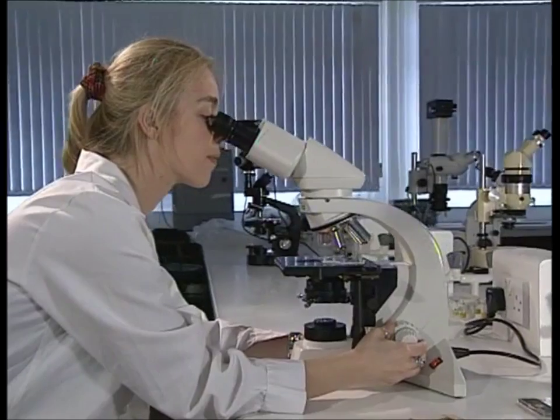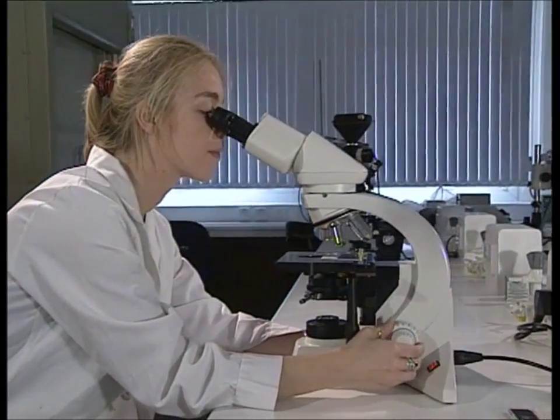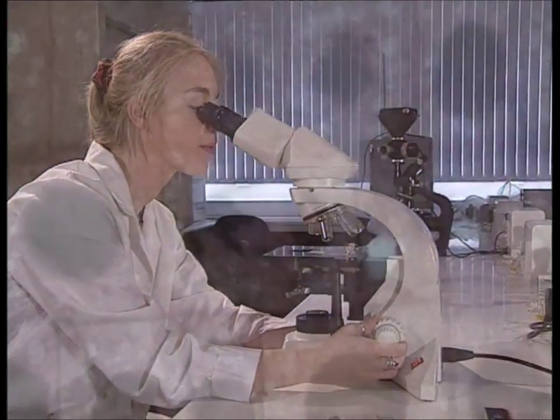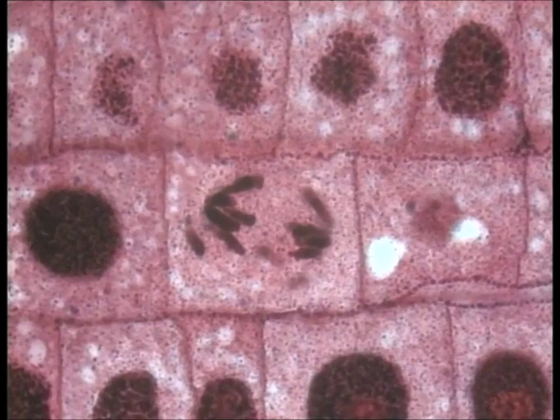The microscope has evolved over the years from the simple magnifying tube of the 18th century to the complex and precision instrument of today.